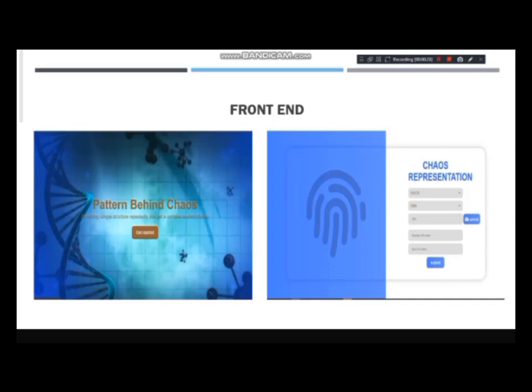In the main page, you are expected to enter some data. Format of your data, is it FASTA or FASTQ? Type of your data, DNA or protein, and if the data is already in your local machine, upload the file. If not, just provide the link for it.